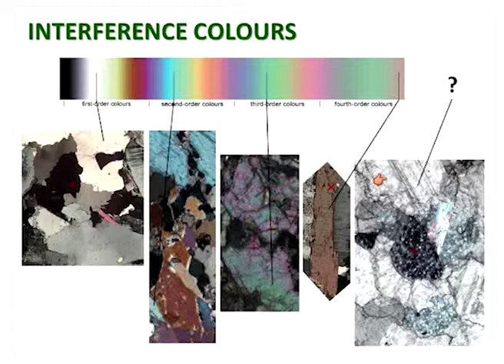Now the other thing, since I've managed to pick a view that was reasonable here, is have a look at this grain in the middle of that calcite. This is a marble, a metamorphic rock, so it's made almost entirely of calcite in this case. But there is a grain in here that looks very different in the middle, that rounded, blobby, dark grain. Now that grain is actually calcite as well, but it's calcite that is in extinction. So it's in one of these 90-degree positions as you rotate the stage that happens to put that crystal into extinction, and essentially the crystal is in an orientation that cuts out all the polarized light.